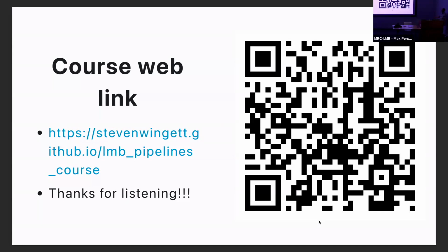It's on my Git repo, and it talks you through the process of getting set up on the cluster, installing Nextflow, how to run an nf-core pipeline, and then it talks you through the output and so on. So that's the second course, and hopefully between this talk and the 2 courses I've made available, you guys can have a start at doing any analysis yourself.